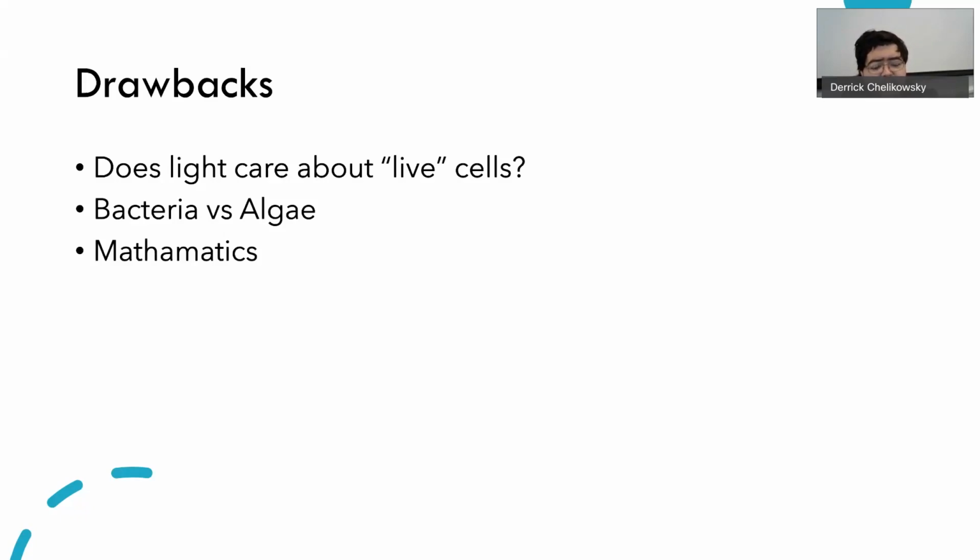There's also the issue of having math. To measure growth using a sample method, it's simply counting. Tedious, but it's counting. With this, you have to use mathematics. Period. You have a percent transmittance, and you have to relate that somehow to the bacteria using constants, coefficients, and the like. Math has to be done. And some people would say that's a drawback to this method.